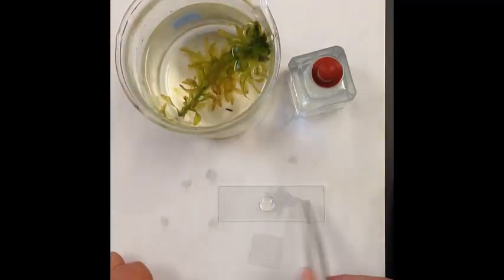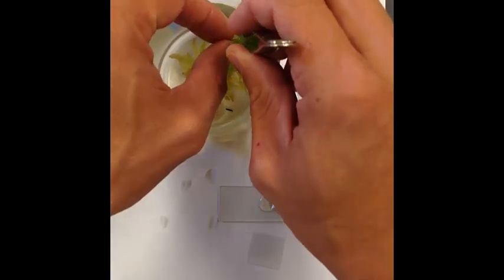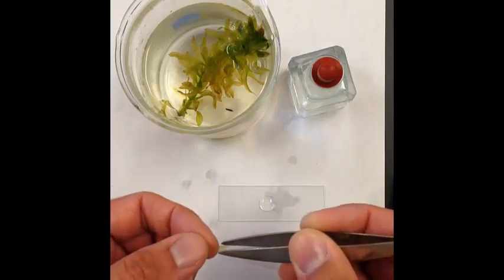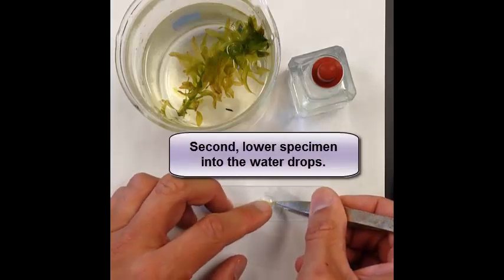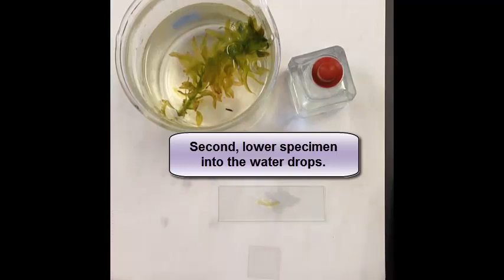Notice how it's not off to the left or the right — it's in the center of the slide. I'm going to go in and pick out a leaf from my Lodia plant. I have a leaf here and all I'm going to do is just carefully and gently place it down on the slide in the water itself. So this is where I want my Lodia leaf to be.